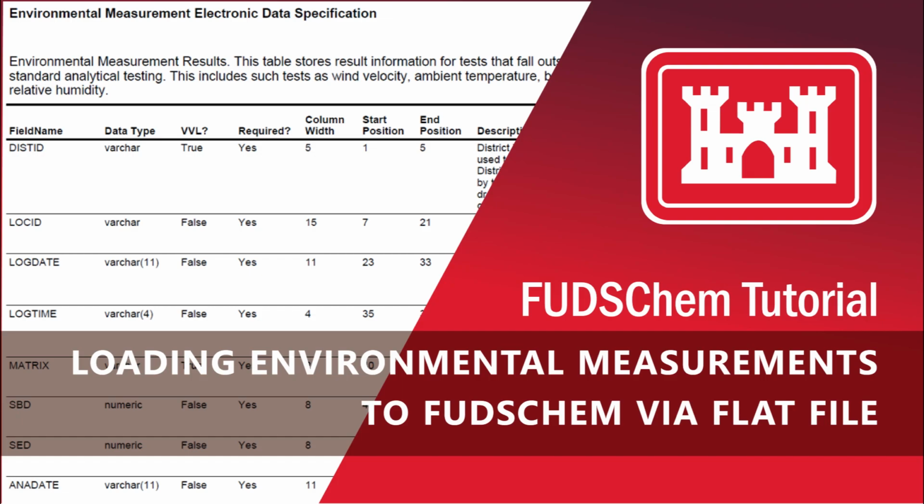This video will go over how to enter environmental measurement data into FUDSChem by uploading a CSV file. This data includes tests such as dissolved oxygen, temperature, specific conductivity, and pH.